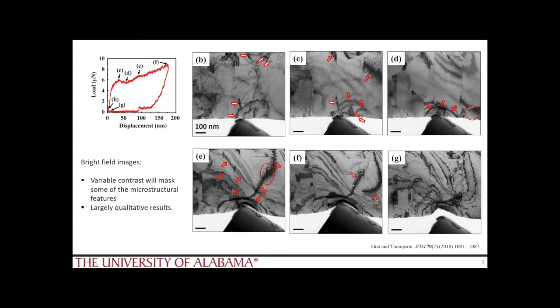We even see at this point, for example, the grain boundary, what appeared to be a single contrast band, being split into two, the onset of dislocations, which you saw in the movie that seemed to be emanating out of the boundary. And then once we're finally done, this is what we're left to look at.